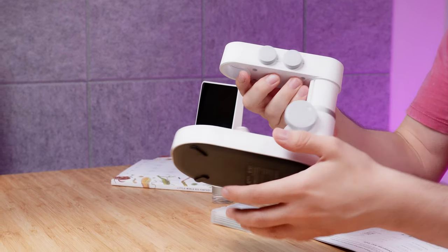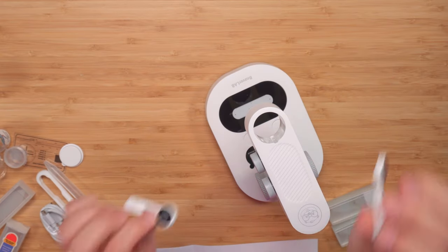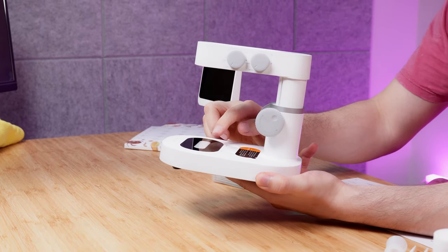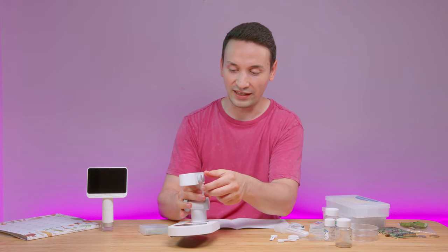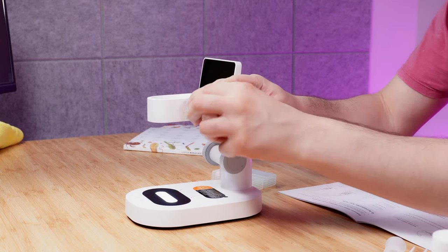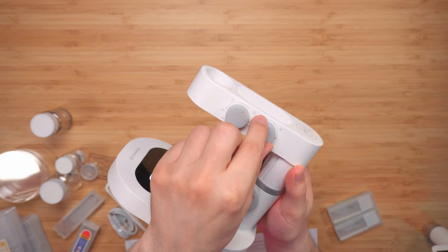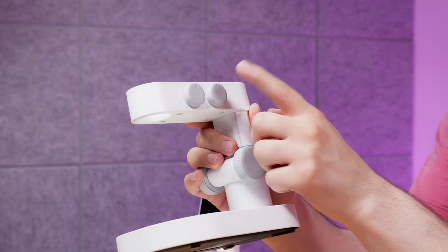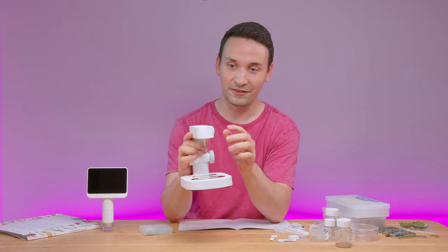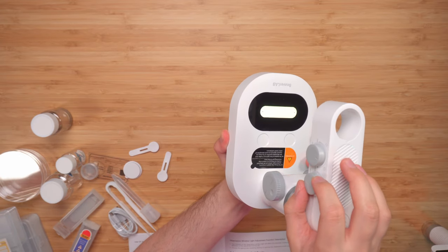The base station has some great features as well. There are magnetic specimen holders if you want to use those. On the bottom, you can turn the light on — and you're able to adjust the brightness. There's another knob to turn on colors, which is a great feature because it makes shots look very cool, and the color transitions are very smooth.